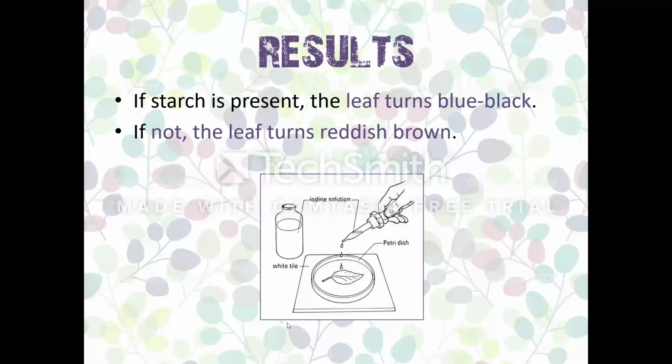The leaf will be stained to that color because we removed the chlorophyll. Okay, so if I was going to do an experiment and ask you questions here, the aim would have been to determine whether starch was present in the leaf. Okay, and your result shows that starch is present in the leaf or starch is not present in the leaf.